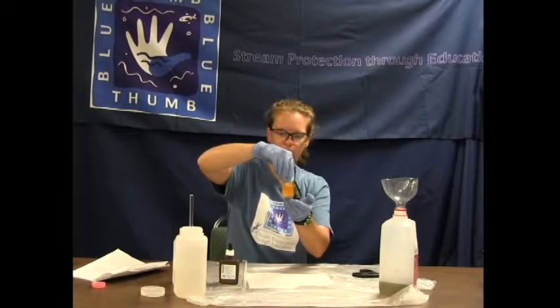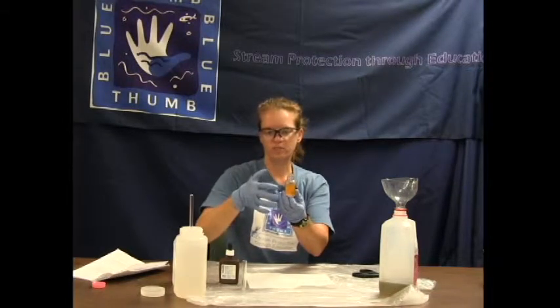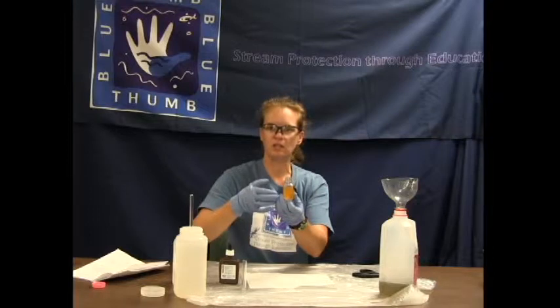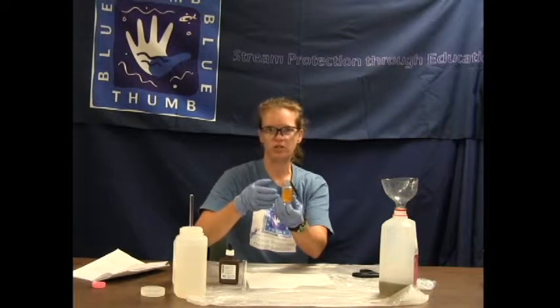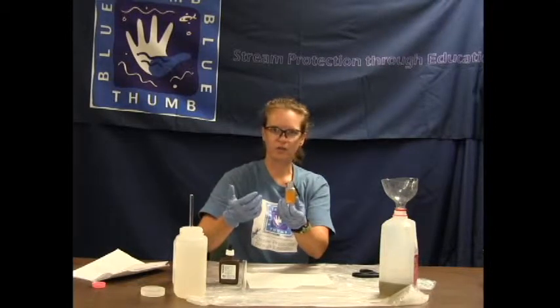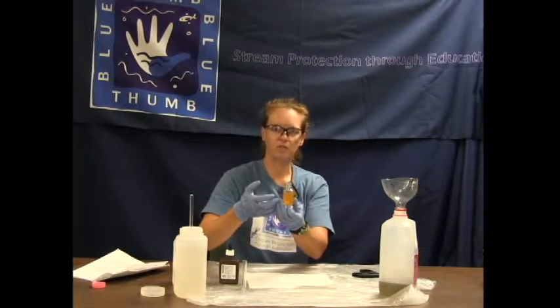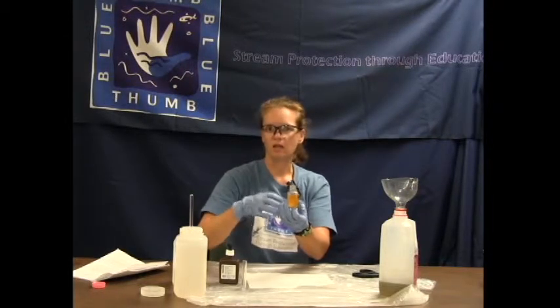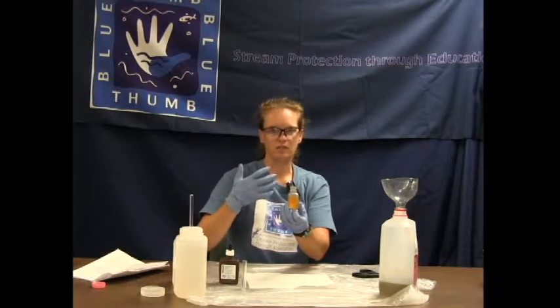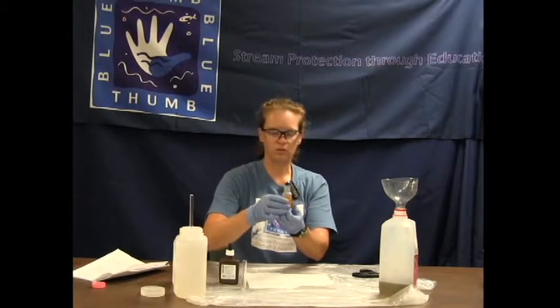Swirl agitate so it is completely one color and we have our color change. This is more of an orangey brick red than what we really need, so if this were the creek water test you would back off one drop. But since this is the blank, we enter on the data sheet one drop used for chloride for the blank, multiplied by five since we are doing the low range test — so the lab blank equals five milligrams per liter of chloride. That just means everything was working properly and the solution changed on the first drop, so we are doing good.